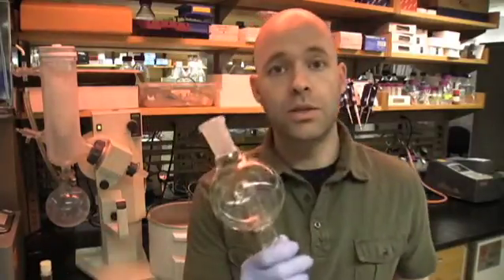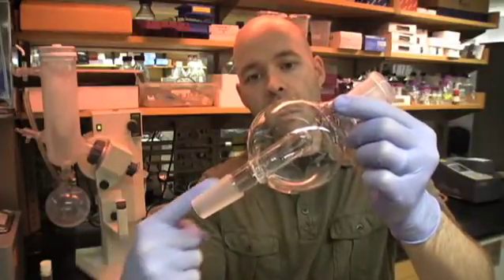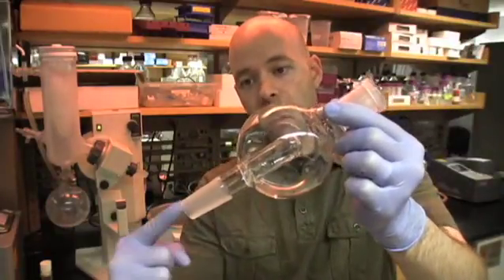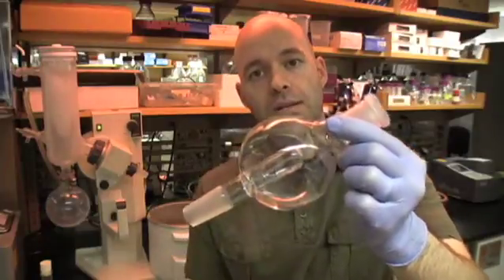The other is to use a bump guard. A bump guard will physically block the solvent from going all the way up and to the other side of the rotovap by that piece of glass in the middle. So the solvent will go up, hit there, and then collect in this flask.